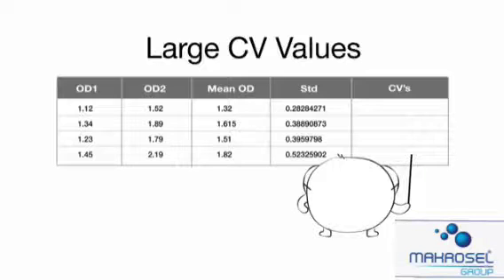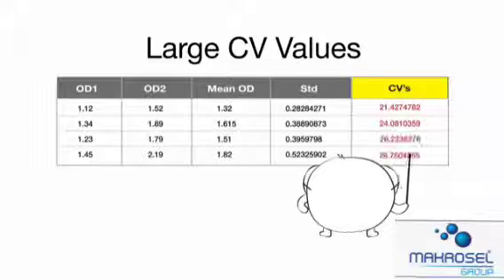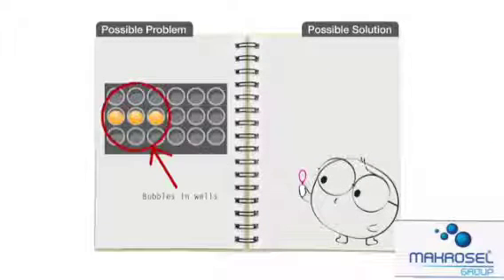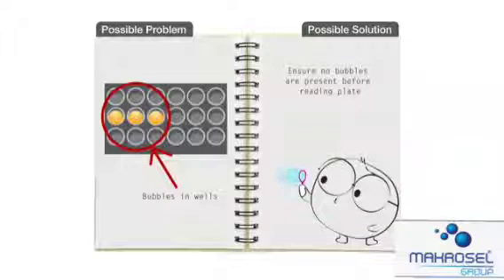Large CV values generally considered to be above 20% for our assays may be due to the following. Acquiring bubbles in the wells during the assay. Please ensure no bubbles are present in the wells before reading your plate.